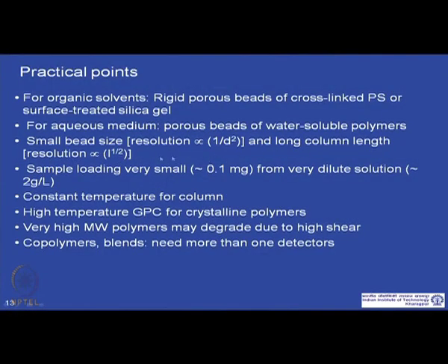The resolution also depends on the length of the column, but not as much as the diameter of the beads. It depends on length L to the power 1/2. So, if you increase the length of the column, the resolution goes up. So, preferably we use a longer column.